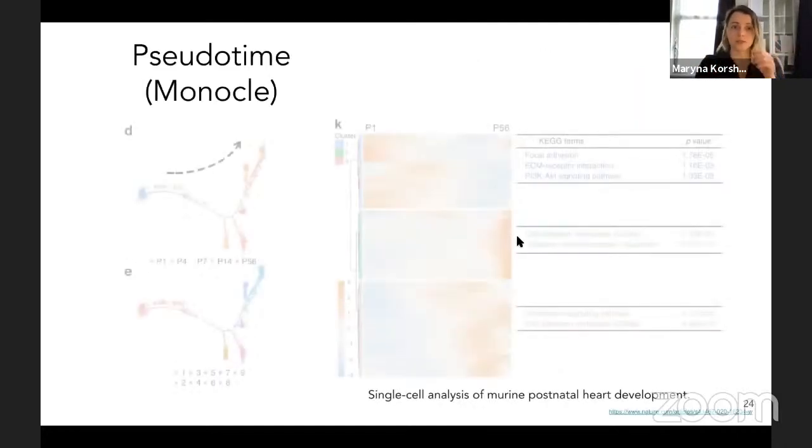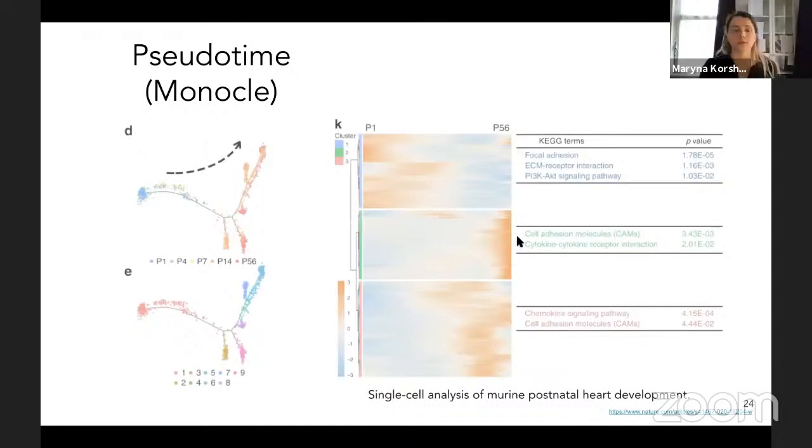So to visualize pseudotime, and what is pseudotime? Pseudotime is the process when you observe your data from the perspective where you try to look at the developmental process in your sample. For example, you're working with highly dividing cells, with some progenitors or maybe IPCs, and as we already see from the chat from participants, some organoid data.